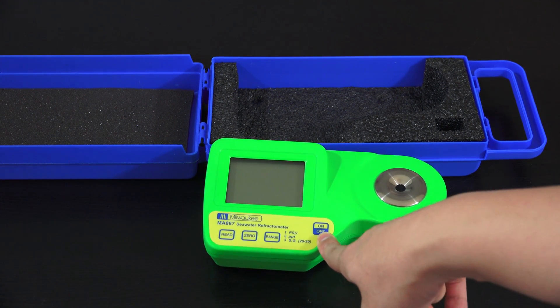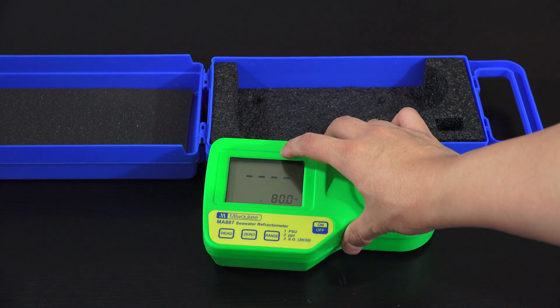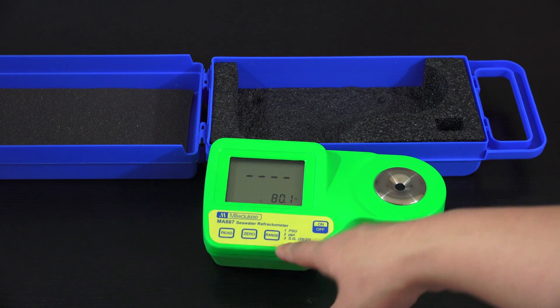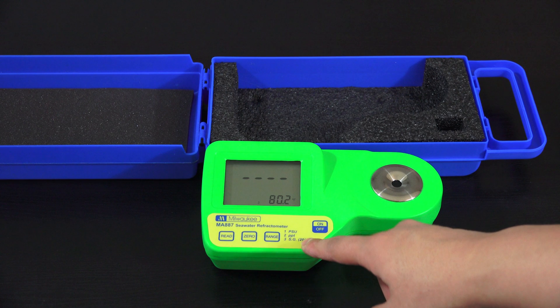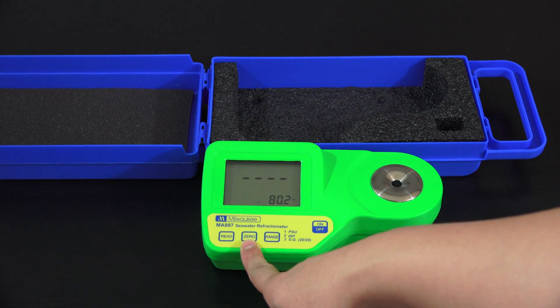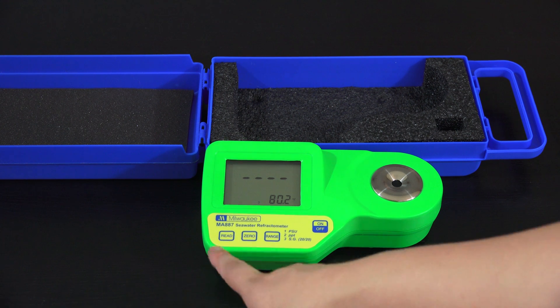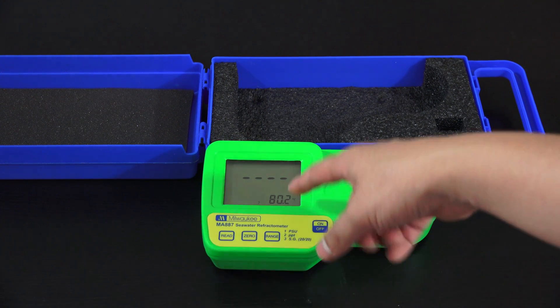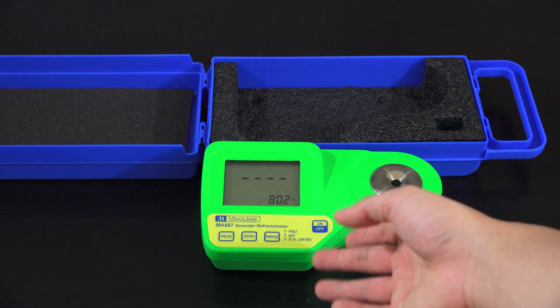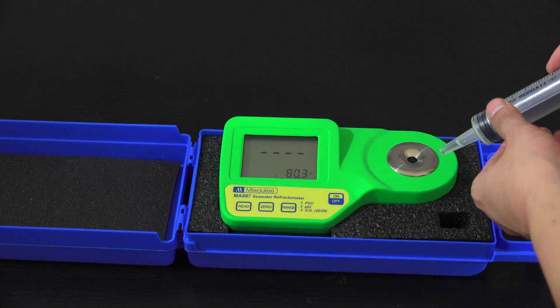With the design, it's just a couple of buttons. There's an on/off button — when you turn it on it shows the battery life and the units you're measuring in. It has three different units you can cycle through, a zero button where you calibrate and set a solution to zero, a read button, and it also measures temperature because temperature plays into your salinity reading.